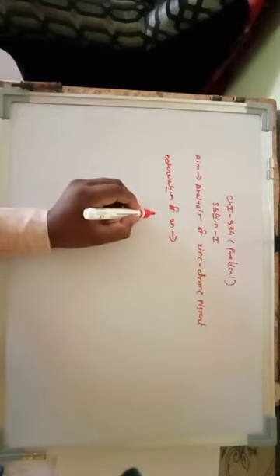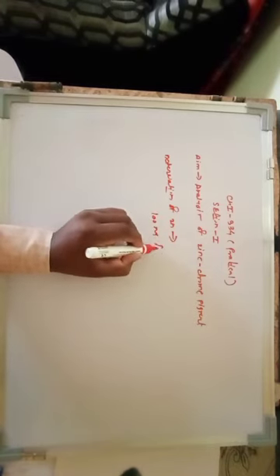For determination of zinc, you have to take 100 ml of diluted solution.